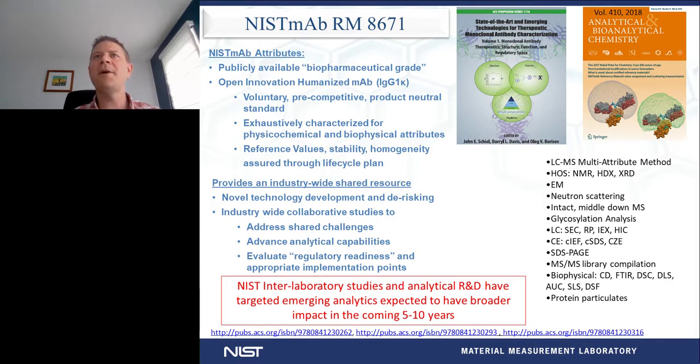I'll talk a little bit more about these articles, but herein we describe the reference values, the stability and the homogeneity of this material that we've assigned at NIST to assure the long-term availability of this material to our stakeholders. So in the end, the NISTmAb material really does provide an industry-wide shared resource. It can be utilized for novel technology development, for de-risking new analytical approaches before they're applied in a regulatory filing.